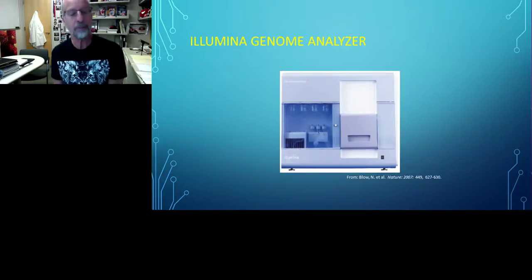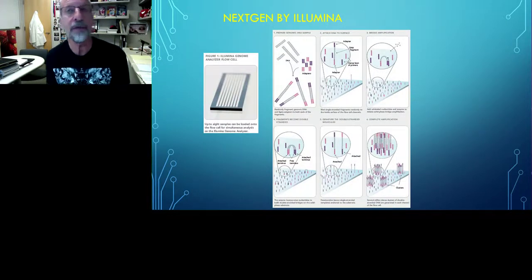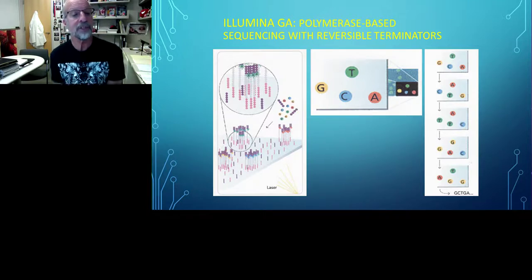The second major platform that was developed was the Illumina genome analyzer, and this is the first generation machine from that. This machine used basically the bridge amplification that I showed you before with all of its advantages as compared to emulsion PCR. Then, once you have the various clusters on the slide, the second improvement, which is a very important improvement on this platform, is that each of the nucleotides has a different fluorophore attached to it, and the fluor is attached in such a way that only a single nucleotide can be added at a time.